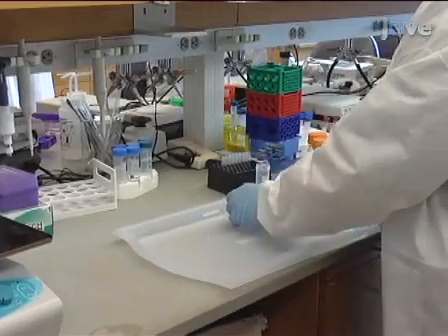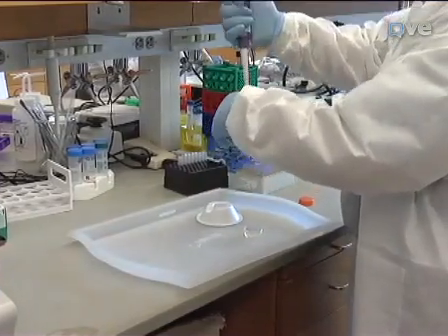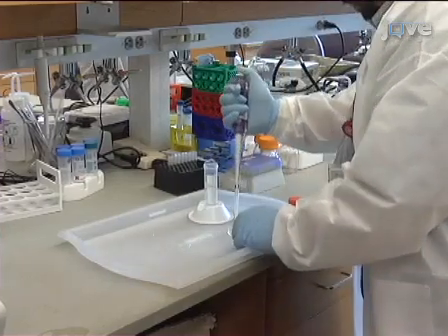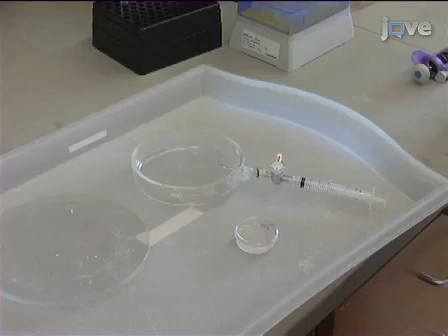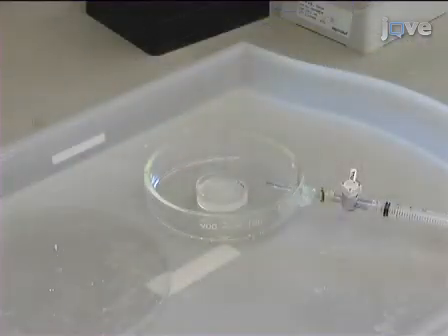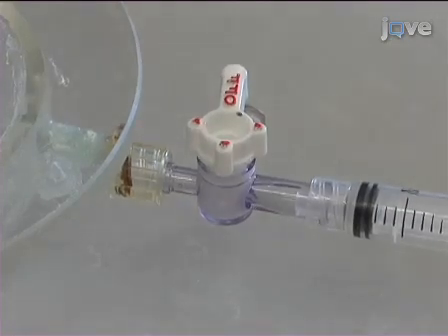Begin this procedure by transferring 1,000 young adult worms to an experimental 35 mm NGM agar plate containing universally labeled carbon-13 glucose and E. coli. Next, place the experimental NGM plate without its cover in a custom glass chamber fitted with a well-sealed 3-way stopcock to allow for precise atmosphere sampling and replacement.